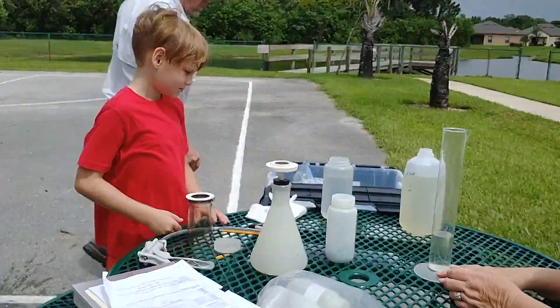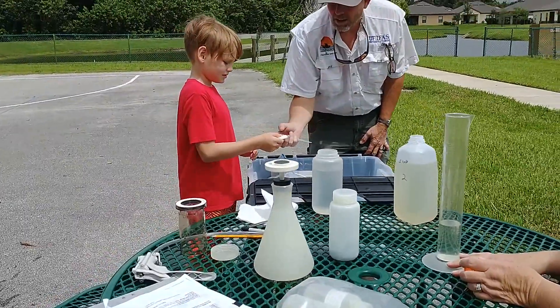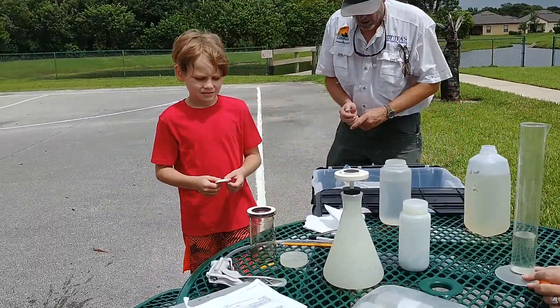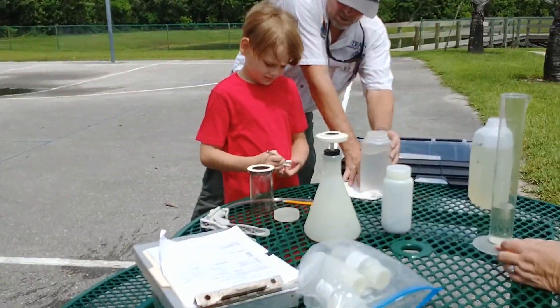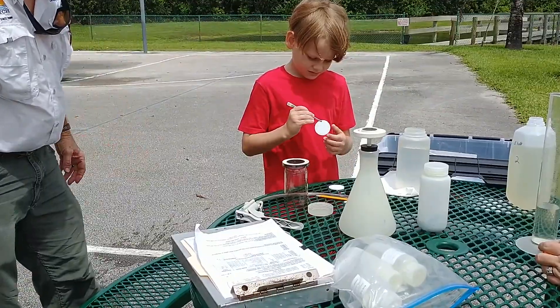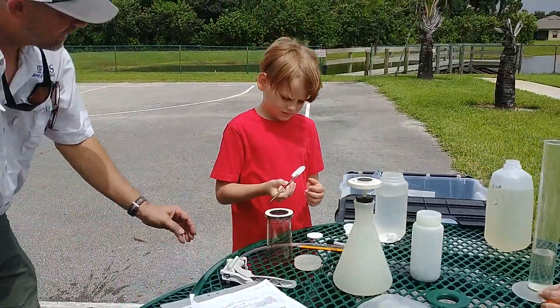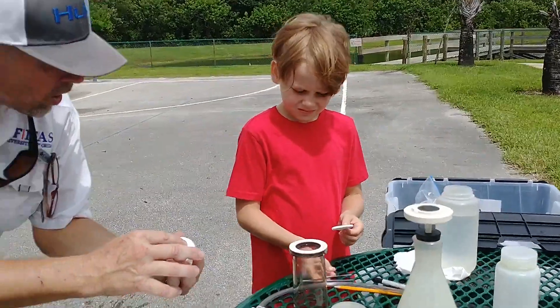Now I want you to take one of these. Hold those in your hand. There's a pair of forceps right there — the tweezers. Try to get one only. You've got to be careful about how you touch it though, Skyler. Hold it on the edges. Take your fingers like this — see, I'm holding it. Hold it just like that.